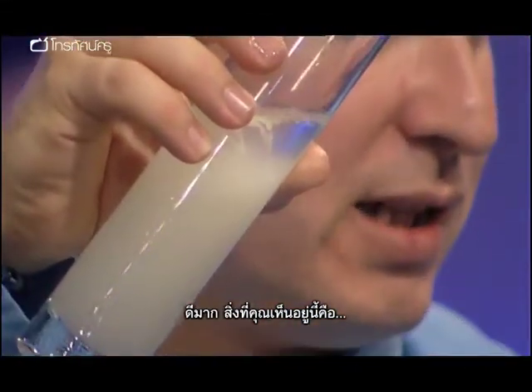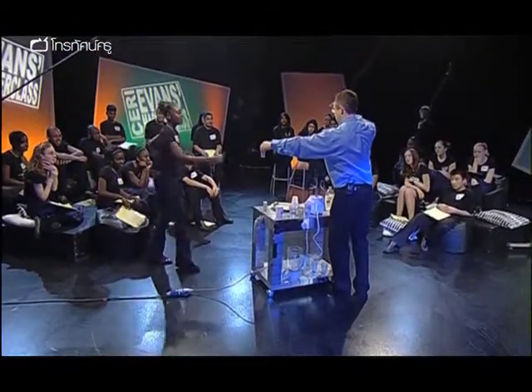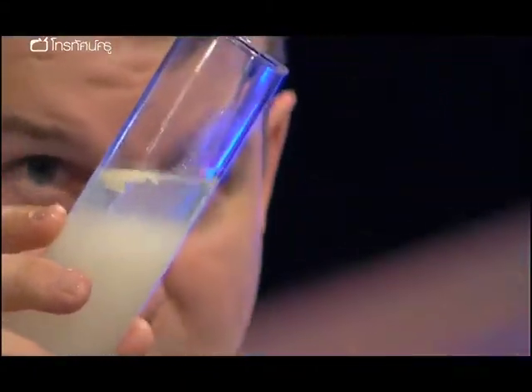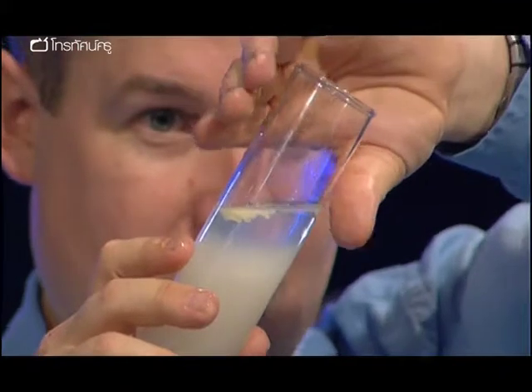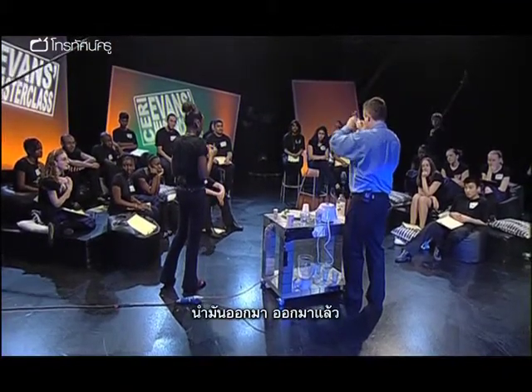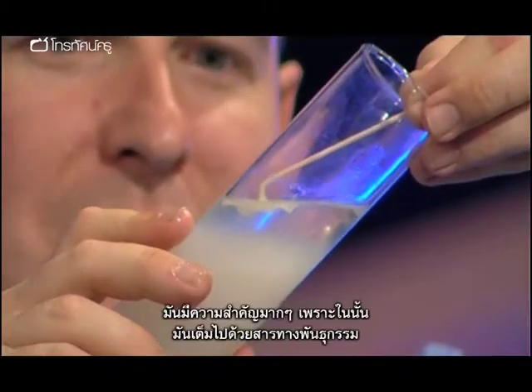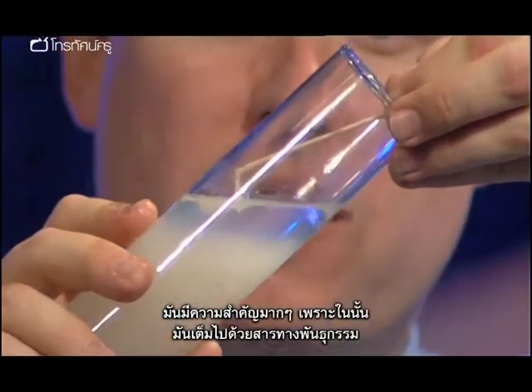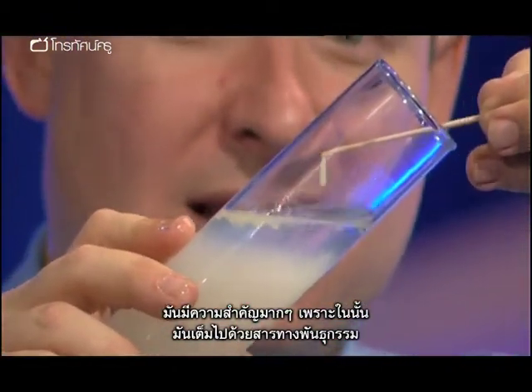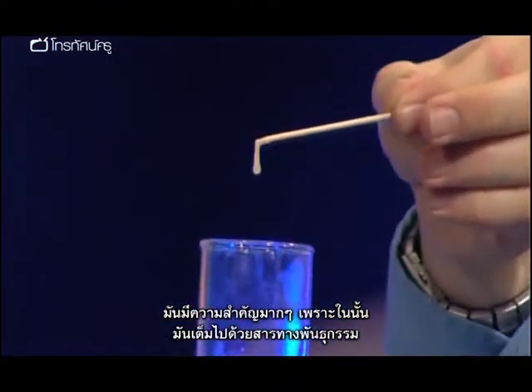Eugenia, can you get me a cocktail stick out of there for me very quickly? Look at that. Can you see it? That is actually real DNA, which has been extracted from these thymus glands. So what I'm going to try to do is pull it out. Here it comes. Can you see it all pulling out? It's a bit like snot.